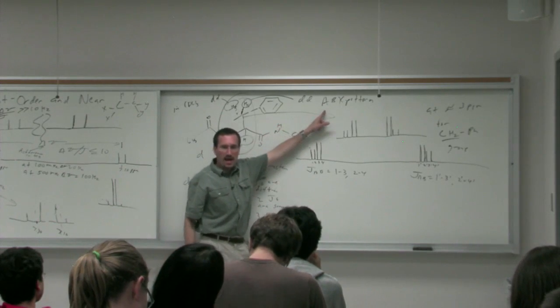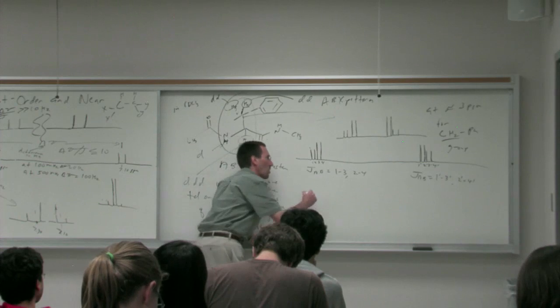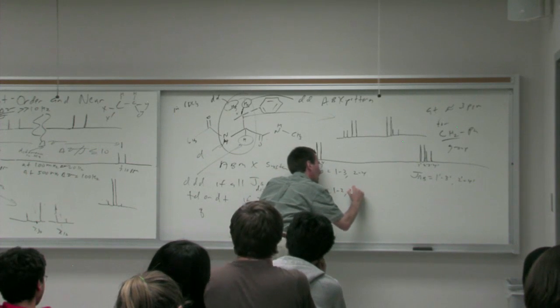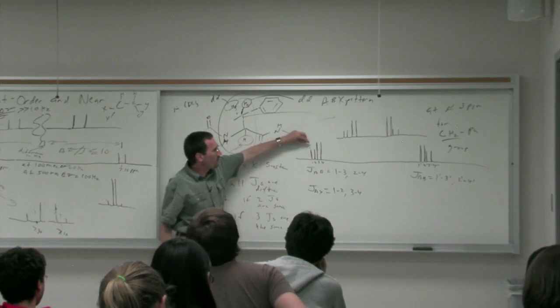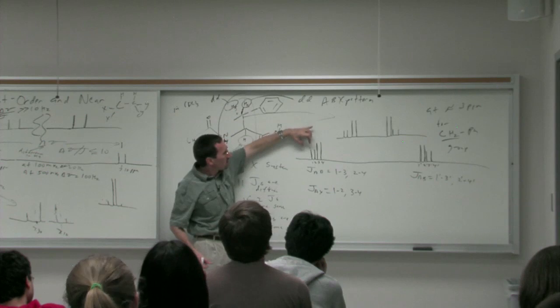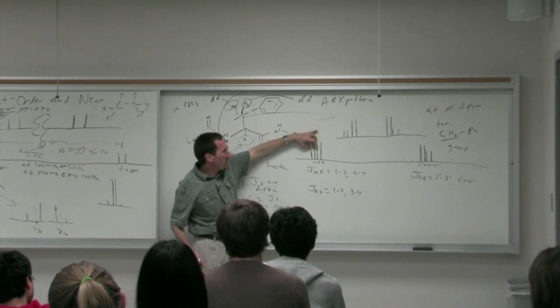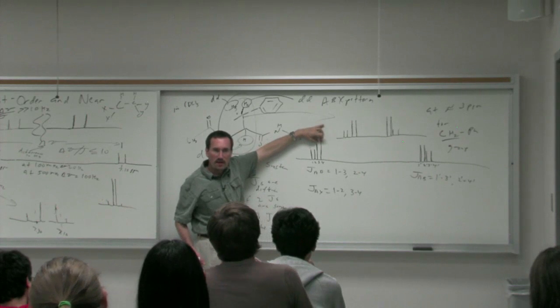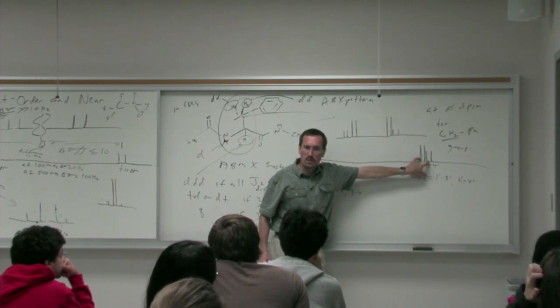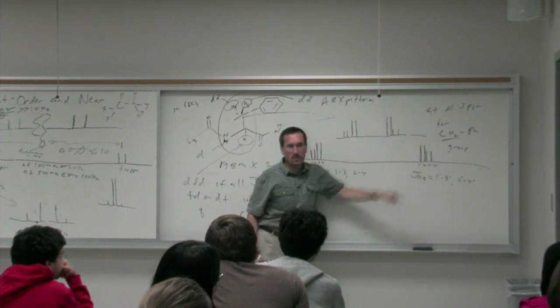In this case, since it's an ABX pattern, the coupling with the other proton, the coupling with the remote partner, we'll call it AX, JAX equals 1 minus 2 and 3 minus 4. And again, those will be the same within experimental error. So let's say for a moment this is 14 hertz. That's also 14 hertz. Actually, the way I've drawn it, it looks more like about 9 hertz. So let's say this is 9 hertz. That's going to be 9 hertz within the limits of experimental error. Here, this distance will also be 14 hertz, as will that distance. This distance, the way I've drawn it, looks like it's about 12 hertz, and that looks like it's about 12 hertz.